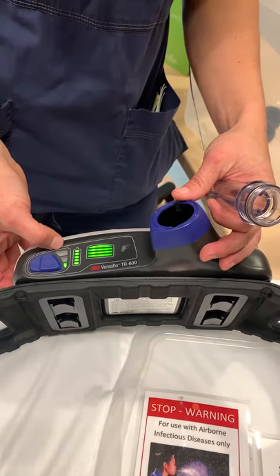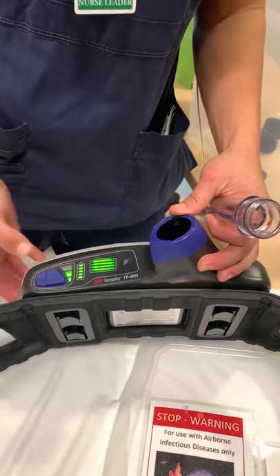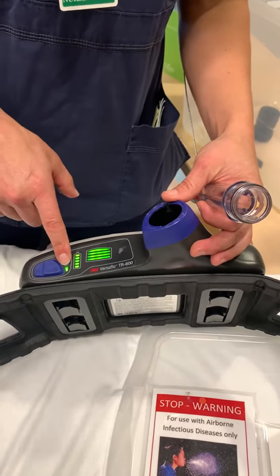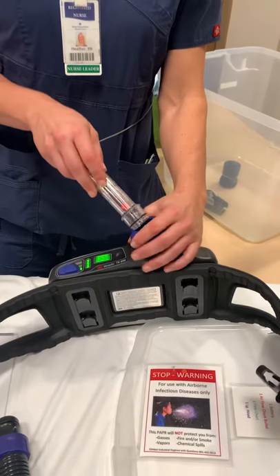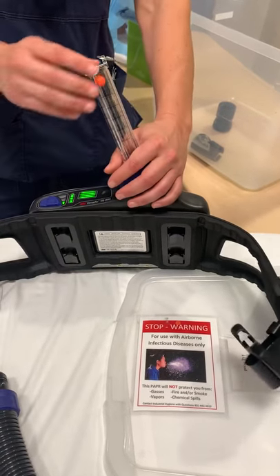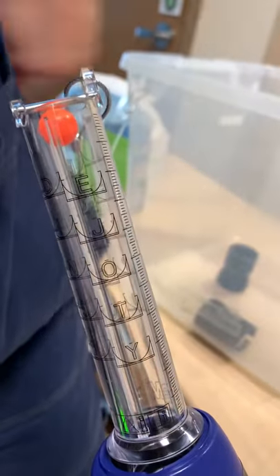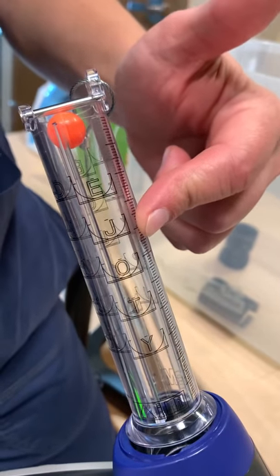It will go through its self-checks with a little vibration. This is your fan speed — you just hold the button and it will pick up speed. If you hold it again, it goes back to the normal or initial speed. When we want to check the airflow test to make sure we have enough airflow, we hook up the little ball and run it for a minute to make sure it stays above the letter J. This ball needs to be above J to meet the criteria for our area.